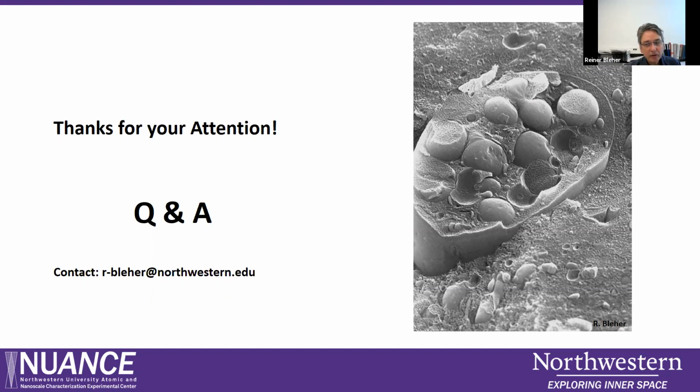There are standard protocols, of course. For best structural preservation, just for looking at the ultrastructure, we usually use osmium tetroxide in acetone. The protocol is you keep the sample at minus 95 or 90 degrees for 4 to 5 days, and then you go up by 5 degrees per hour until you reach room temperature, and then you can do the resin embedding at room temperature. That is, I think, the standard approach for high pressure frozen samples and freeze substitution.